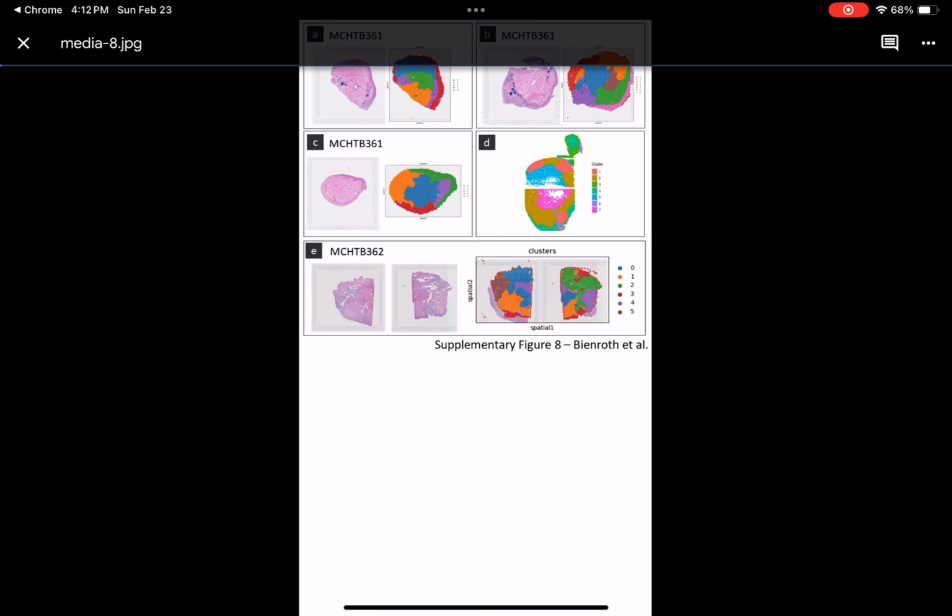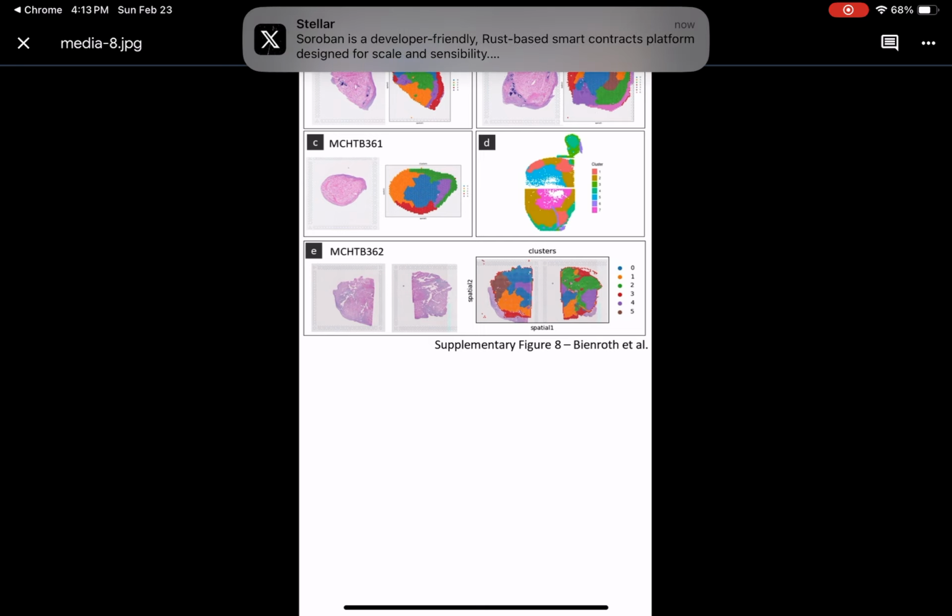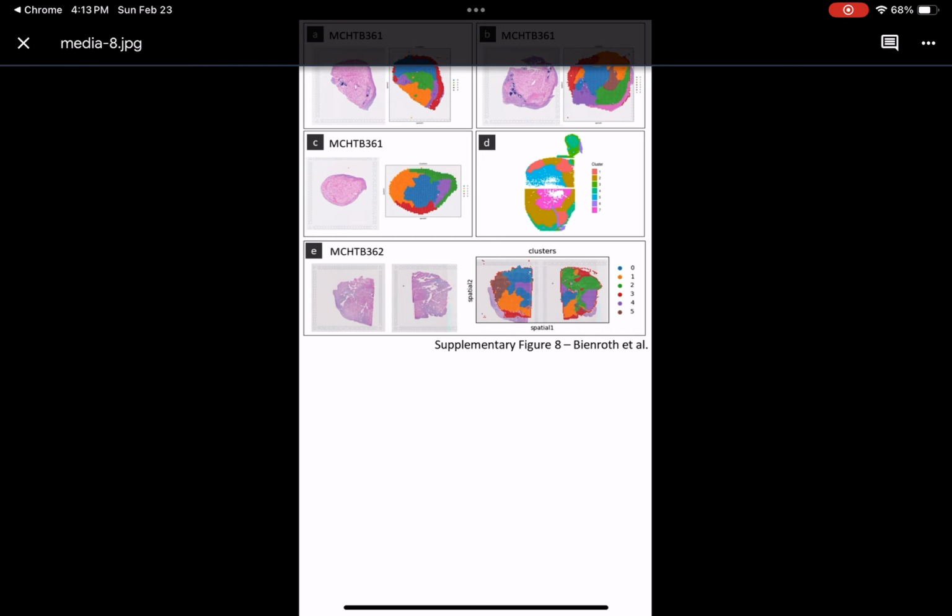Filter parameters were established independently for each sample. Then markers for each cluster were used as the input for gene ontology enrichment analysis using Metascape, 38, or WebGestalt, 39. These findings were then validated orthogonally, outside of the VR-Omics framework, using a series of comparable tools requiring coding experience. Samples were pre-processed and filtered in Seurat, then clustering for individual or joint objects for all patients was performed using the BayesSpace algorithm, 40. Gene ontology enrichment analysis was performed as outlined above.